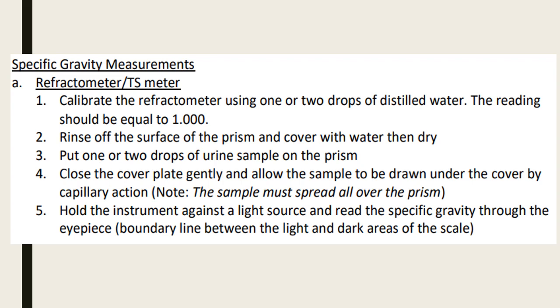When you calibrate, please note that the calibration for your refractometer or total solids meter, if you're using this in the laboratory, should be done daily. After you did your calibration, you rinse the surface of the prism and cover with water, then dry.